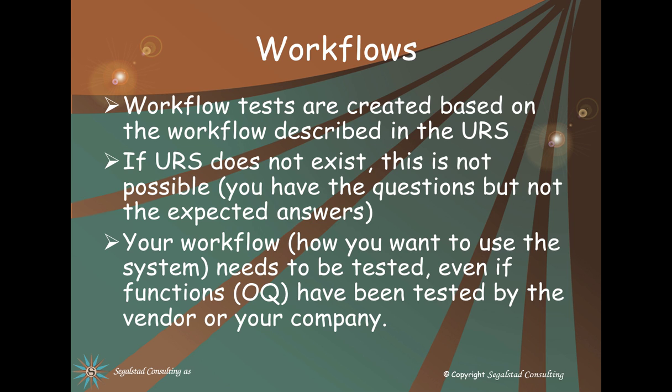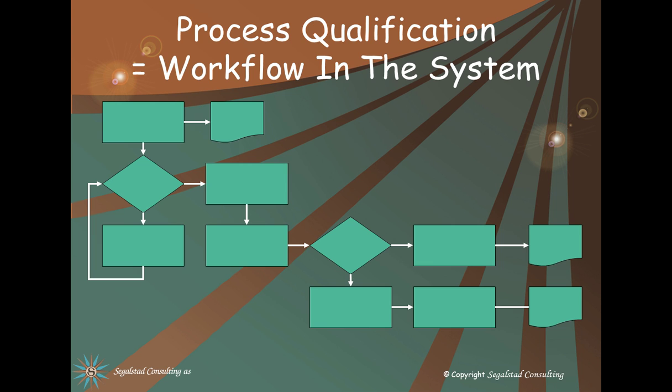Workflow tests are created based on the workflow described in the user requirement specification. And if the user requirement specification does not exist, it is not possible to test it because you have the questions, but you do not have the expected answers. Your workflow, which is how you want to use the system in your organization, needs to be tested, even if your functions OQ have been tested by the supplier or by your company separately.